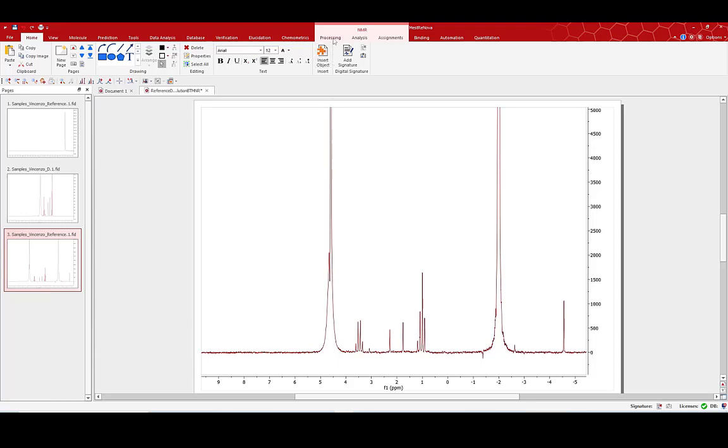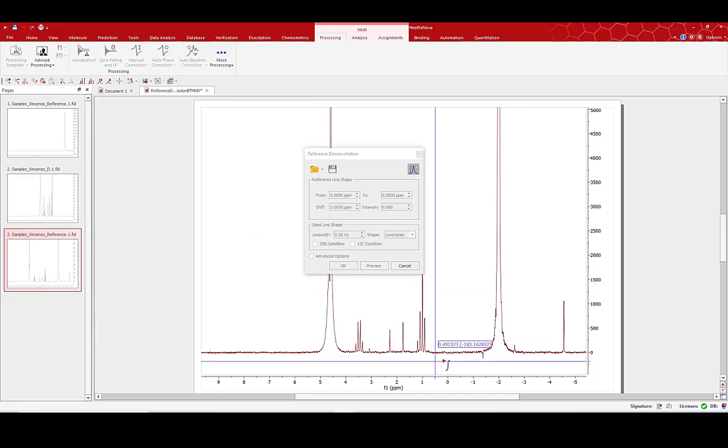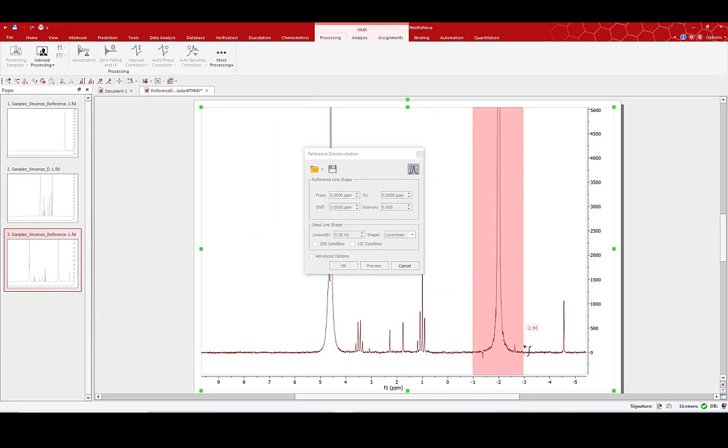To perform the reference deconvolution, I'll select the processing option and from the drop-down menu choose reference deconvolution. Simply dragging and dropping, I can select my reference peak. There are options here to fine tune that selection, but I'm quite happy with what I've selected. Now I need to set my target line shape and width.